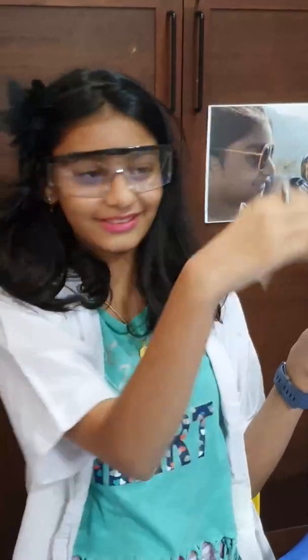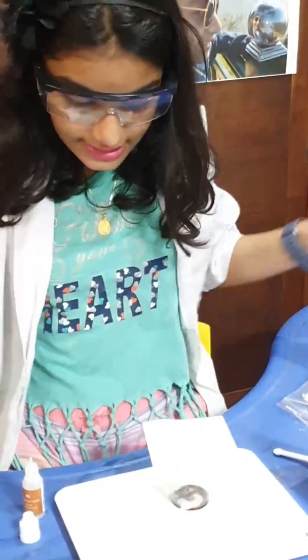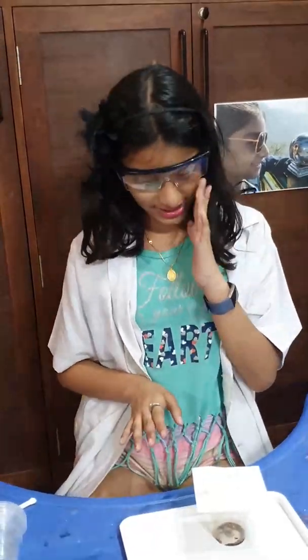I think I could see my fingerprints — can you see my fingerprints? Now you will see. Leave this on the spot for 15 minutes. I think it's been about 15 minutes, maybe more than 15 minutes.